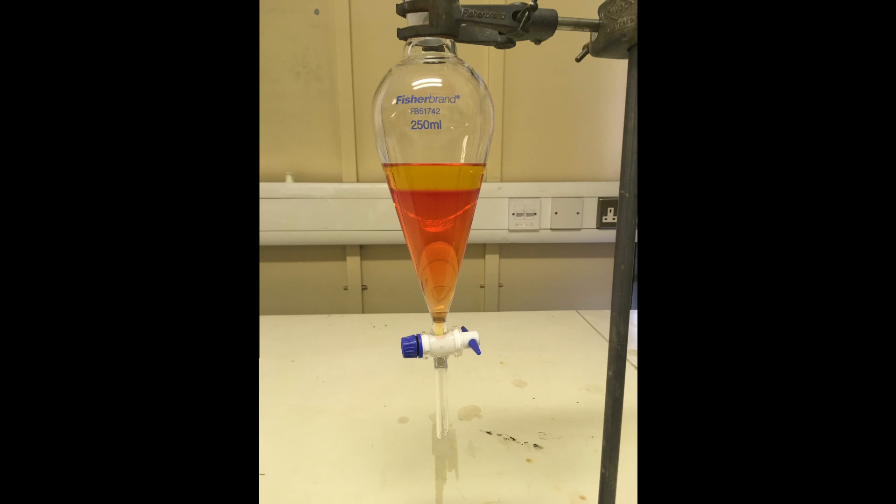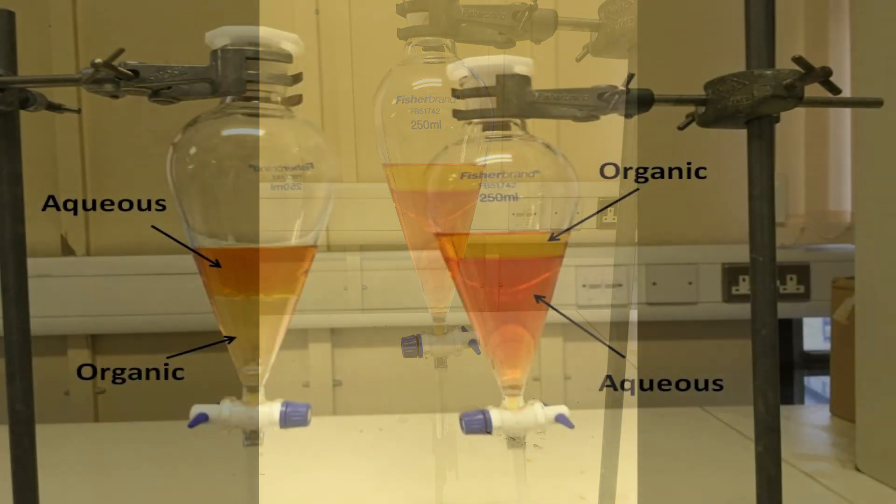The key to the separation of layers in a separating funnel is density. The bottom layer is the more dense solution, but this is not always the aqueous phase.